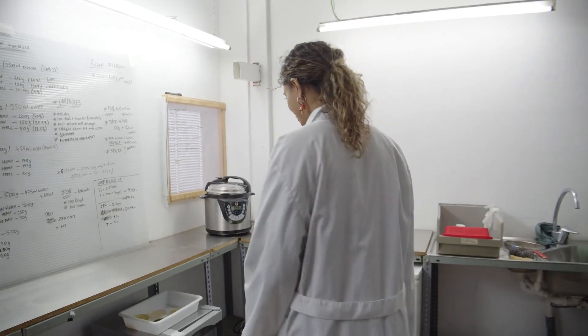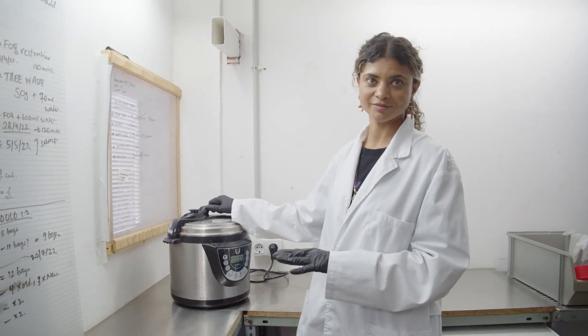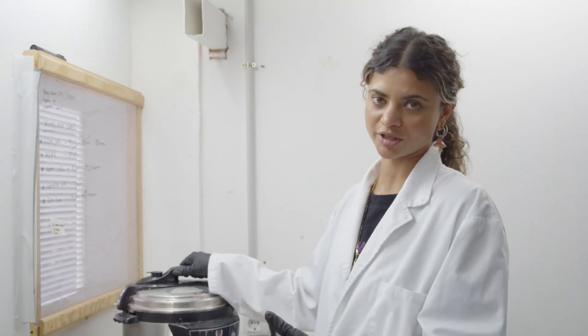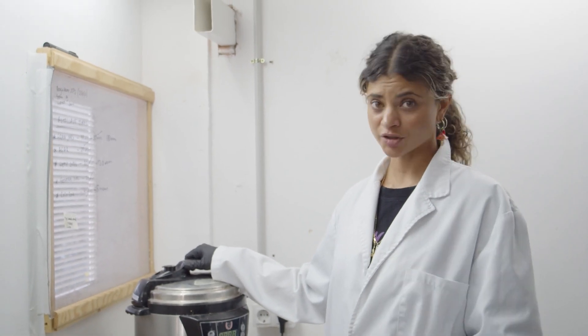Over here we have a pressure cooker — there are many types, and this is an electronic one. You set the time, leave it, and it alerts you when finished. It brings contents to high temperature and pressure to sterilize or kill any contamination in the substrate or agar. For agar, cook for roughly 15 minutes at 15 PSI. For grains, roughly 90 minutes. For substrate pasteurization or sterilization, roughly 80 minutes.